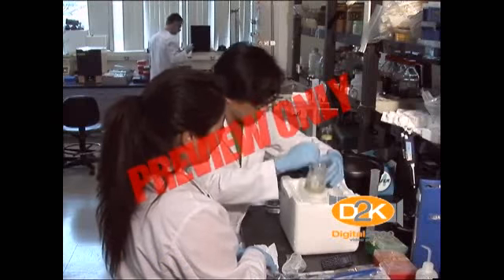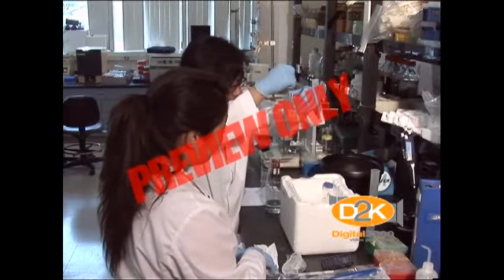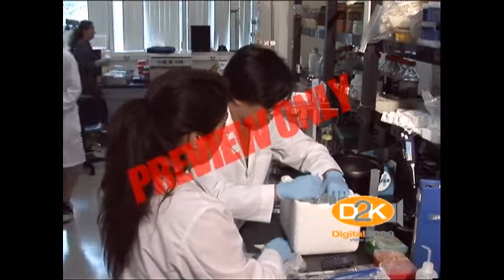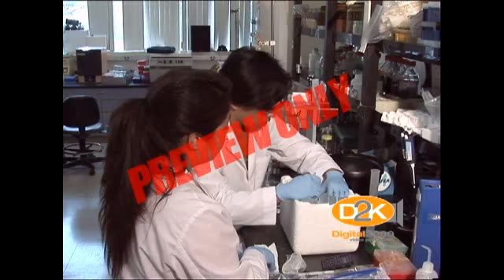All persons working with this material shall be informed as to the meaning of the various tags and signs used throughout the workplace and what special precautions are necessary.